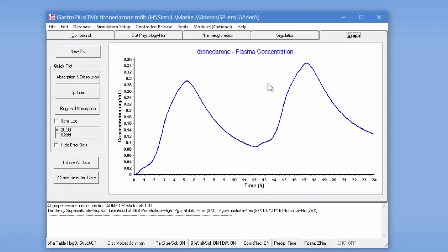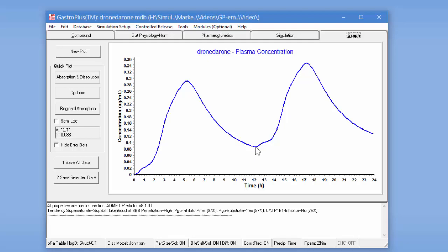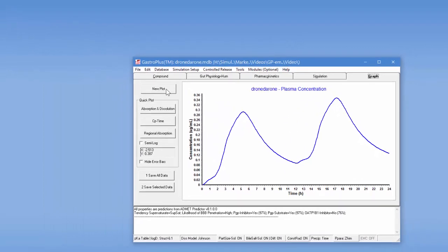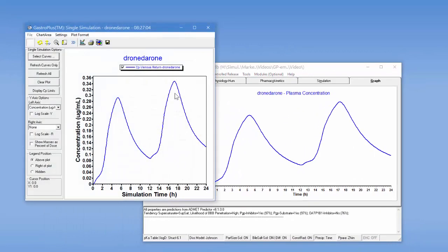So if we go to the graph tab, we see the graph for the parent compound Dronedarone. So it goes up and then here's where you get the second dose and that starts heading up.